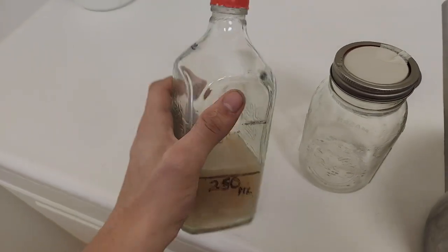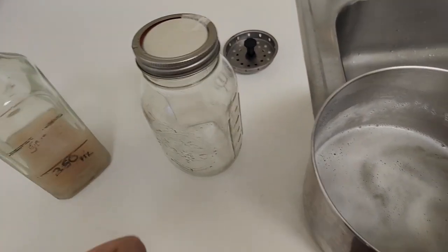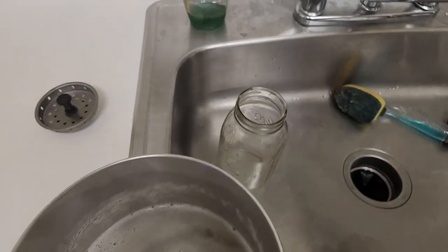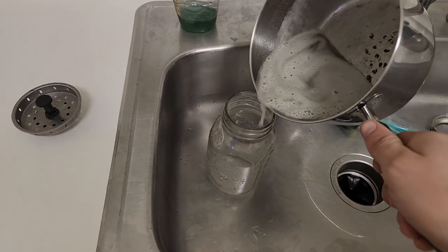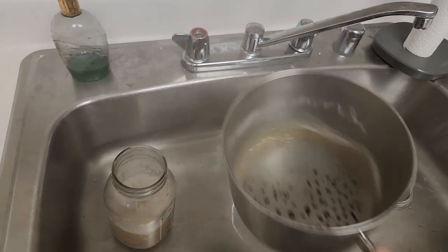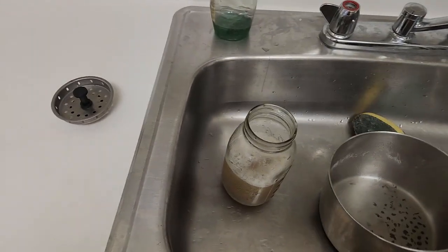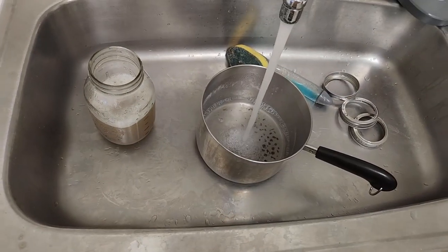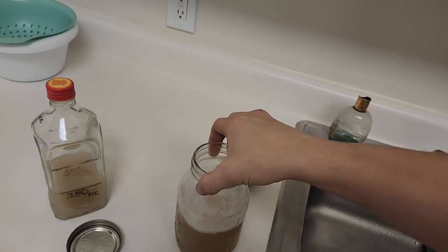I like to either use these old alcohol bottles or just a jar. They both work just fine. It's just preference. So we're gonna go ahead and just pour it back into this jar. And I like to rinse out my pot immediately because the agar doesn't get a chance to solidify. So there you go, 500 milliliters of agar.